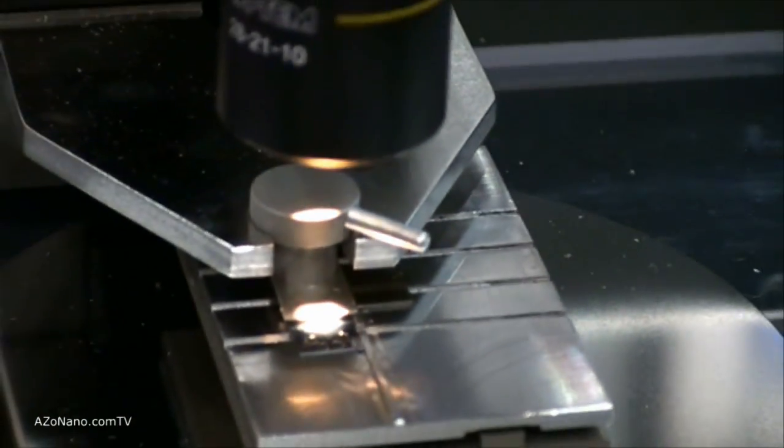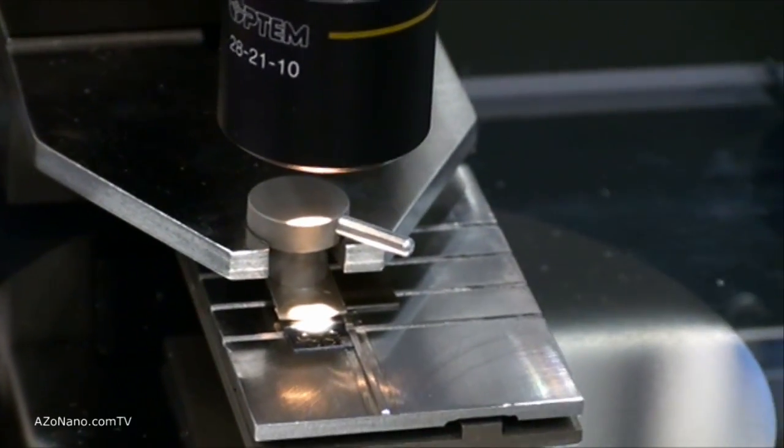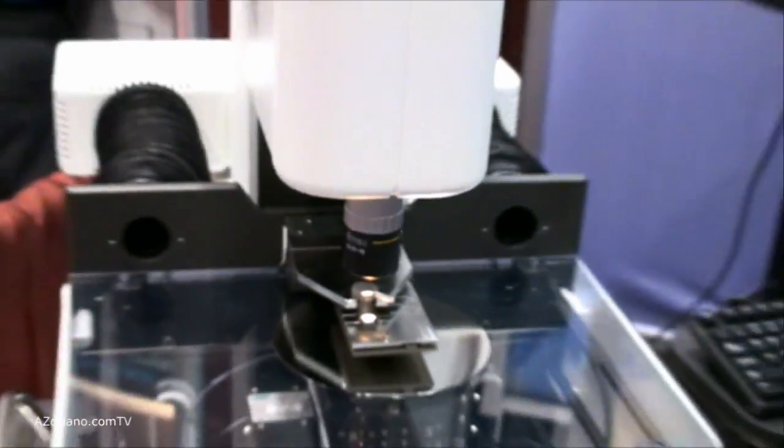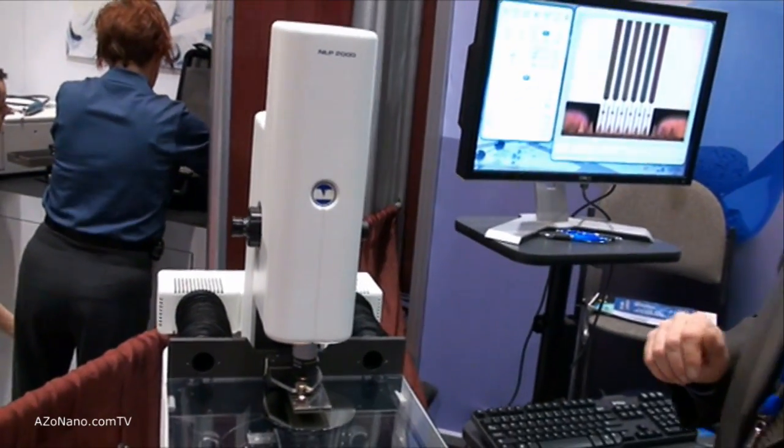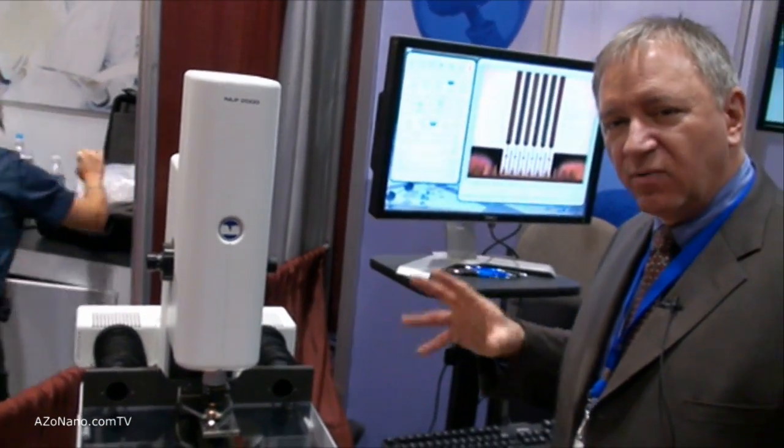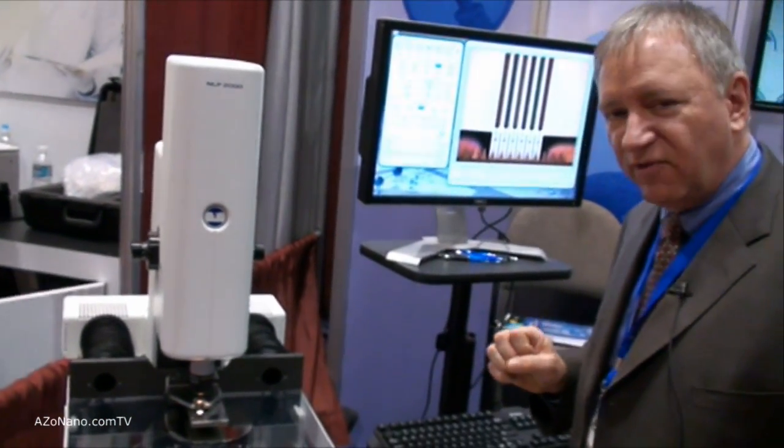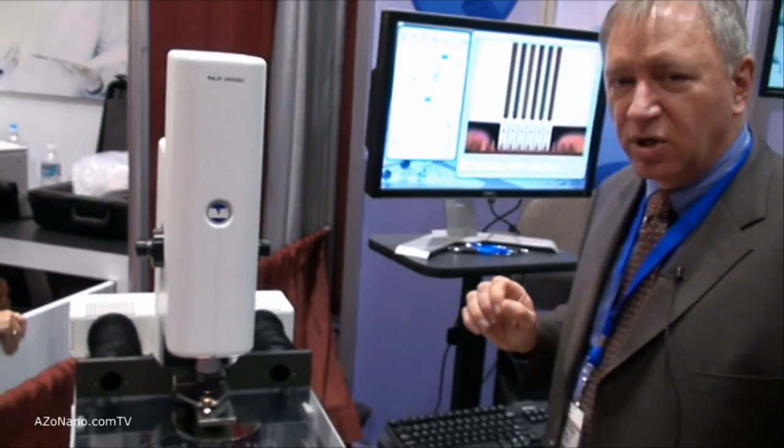It depends on the chemistry and the inks that are used. A high-resolution camera system above that allows us to see features as small as about 300 nanometers. We've done resolution standards to qualify the system, so it is a very good camera system.